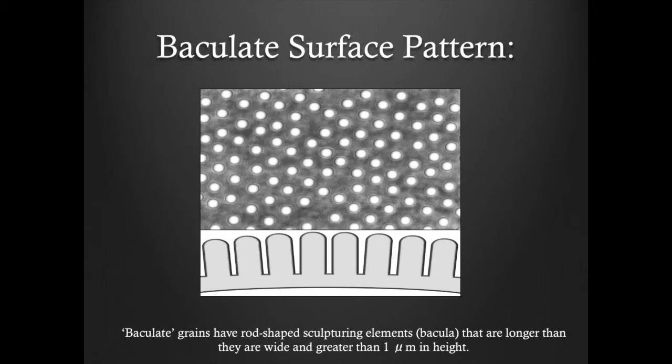Rugulate grains have broad shaped sculpturing elements that are longer than they are wide and greater than one micrometer in height.